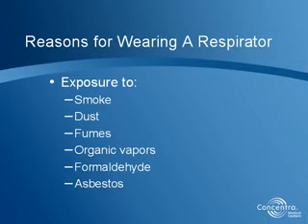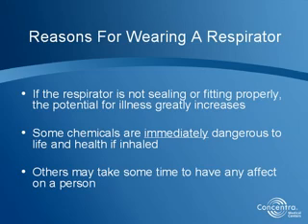There are various reasons to wear a respirator. A few examples would be a subject working with smoke, dust, organic vapors, formaldehyde, or even asbestos. If the respirator is not sealing or fitting properly, the potential for illness greatly increases. Some chemicals are immediately dangerous to life and health if they are inhaled. Others may take some time to affect that person.